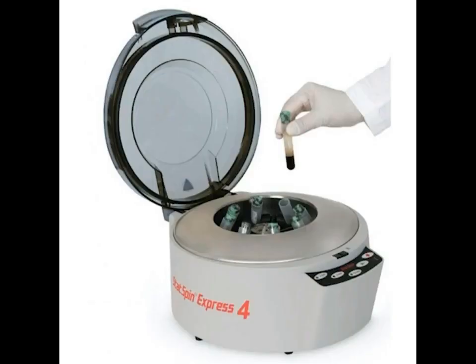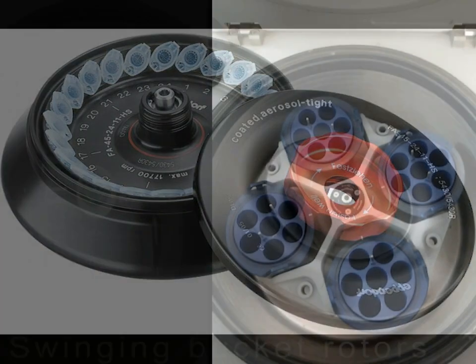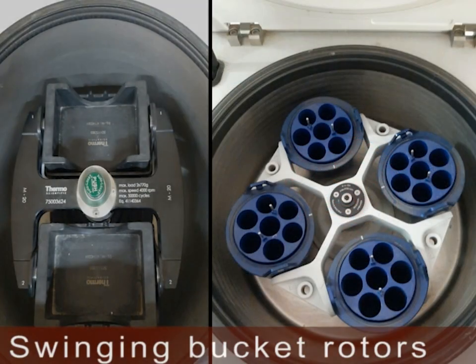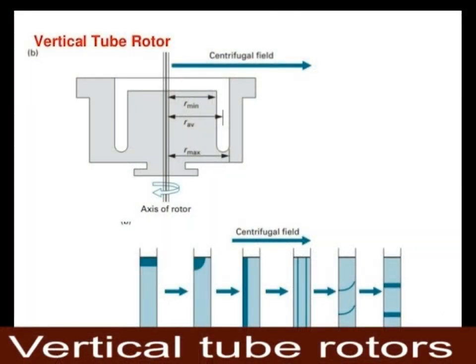The other classification of centrifuges is based on the design and types of rotors used. There are four types: swinging bucket rotors, fixed angle rotors, vertical tube rotors, and zonal rotors.